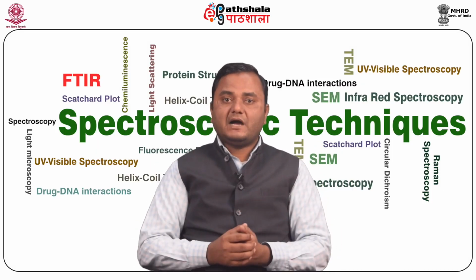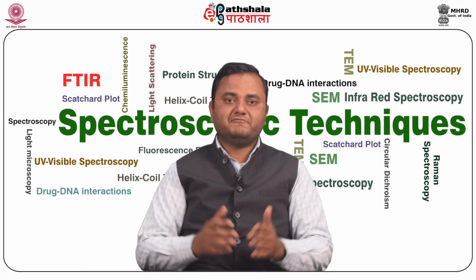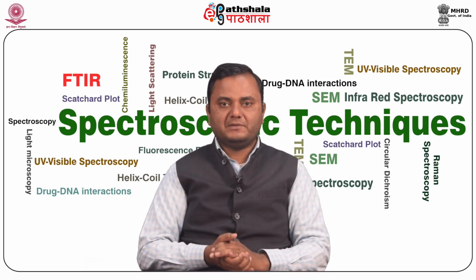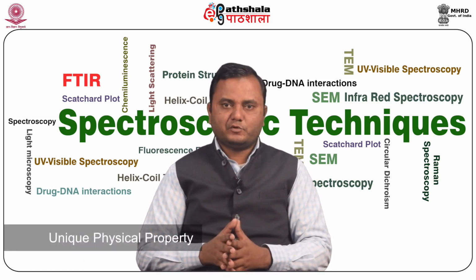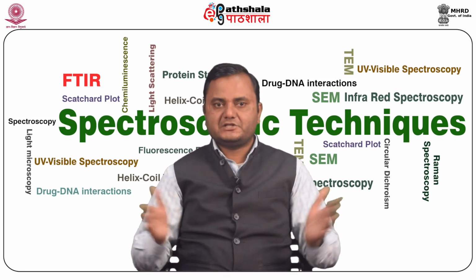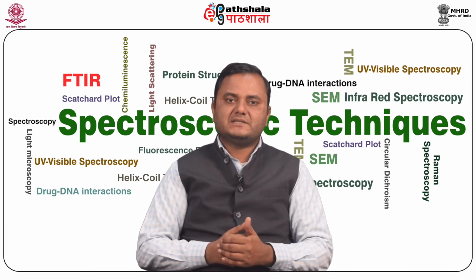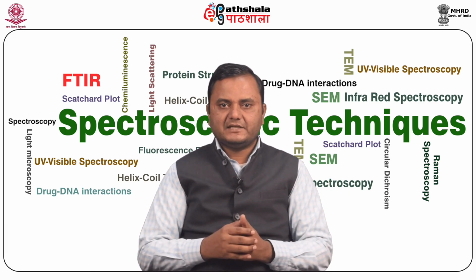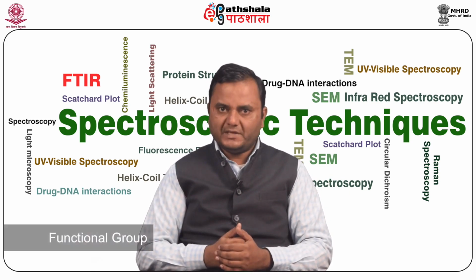Now we talk about the IR spectrum. The IR spectrum is actually the vibrational spectrum of a molecule, considered to be a unique physical property and characteristic of the molecule. IR spectroscopy measures the bond vibration frequencies in a molecule and is used to determine the functional group mainly.